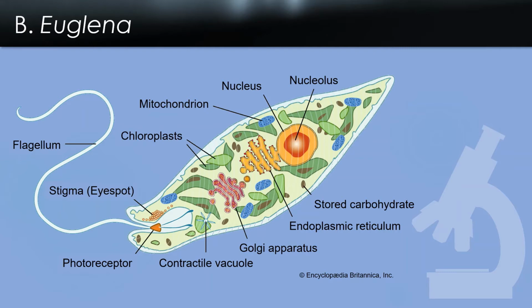So the eye spot, you can see, is labeled right here. And it is pretty visible on a lot of the Euglena cells. It's kind of a reddish, brownish, orangish color. The eye spot apparatus is basically a photoreceptive organelle. So this allows the Euglena cells to sense the light direction and intensity and respond to it. They want to swim either towards the light or away from it. And these are photosynthetic, so probably they're trying to swim towards light unless it's too bright, would be my guess.